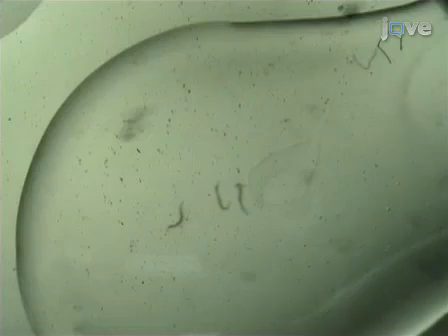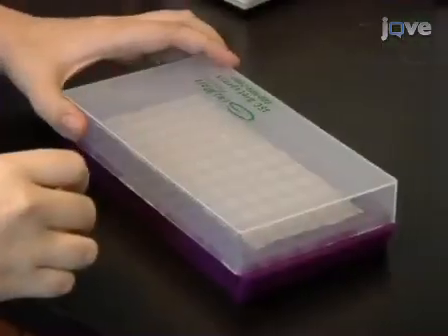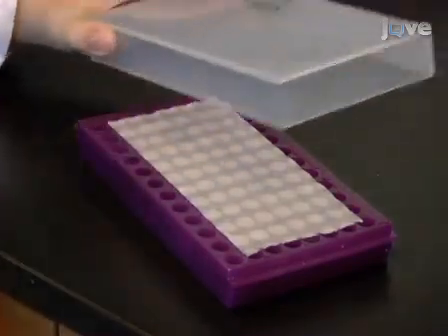After injection, cover the worms with 0.5 milliliters of egg buffer applied using a pulled Pasteur pipette. Then allow the worms to recover for 1 to 2 hours at room temperature in a light-free, humidified chamber.